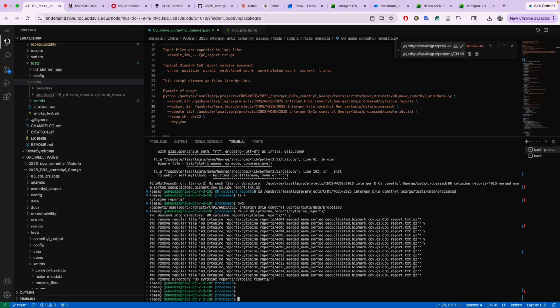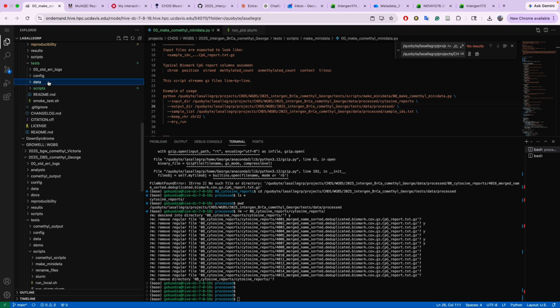All right. The reason why I didn't do the rf is because I just wanted to see what I was doing when deleting it. If I had just deleted the wrong folder while I was in the data folder, then that would be rerunning this pipeline again. So those are some things you need to be very careful about, especially when deleting data. So anyway, sorry about that. We're gonna rerun this again.